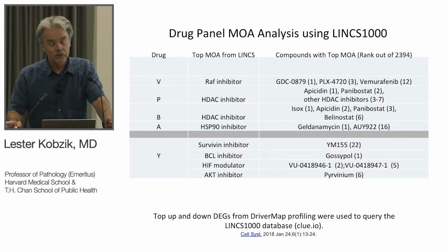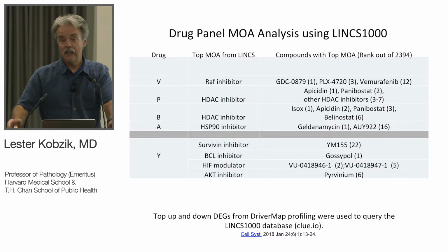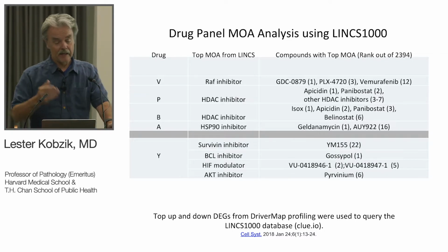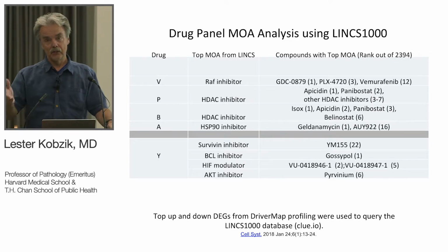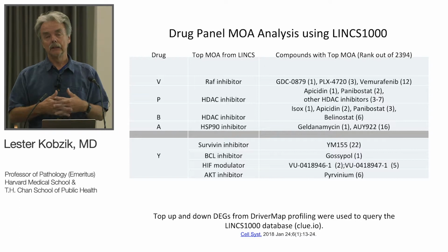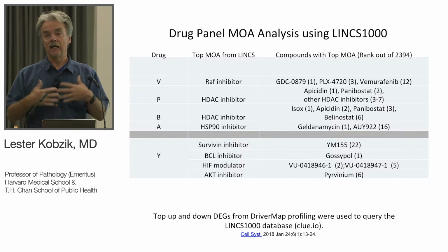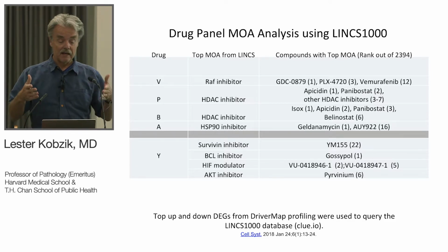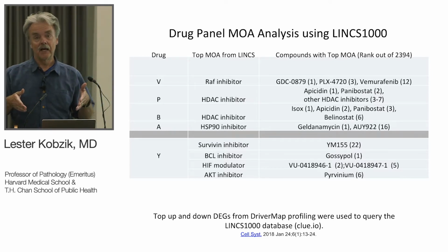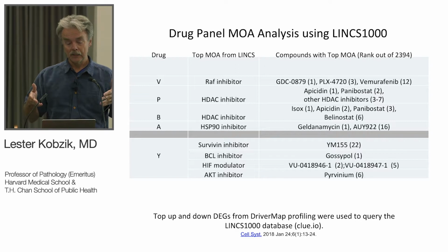All right, so what they have developed is a tool. You can come in with your own data set, as I have, with things that are up or down for each drug. Enter the 150 genes up, 150 down, that's their limit, the top most differentially expressed genes. And they will match your signature to what they have learned for their extensive analysis. And the good news is they in fact have the A375 as one of their cell lines that they've analyzed.